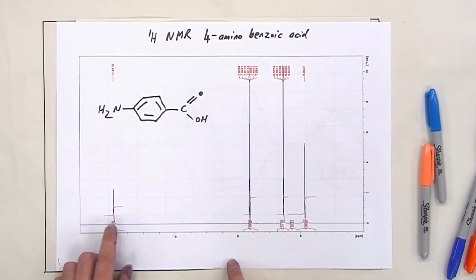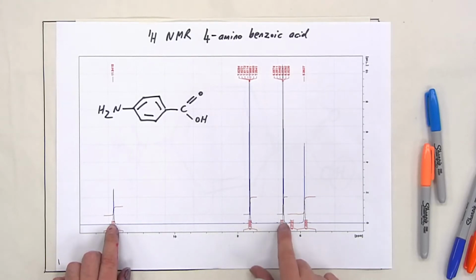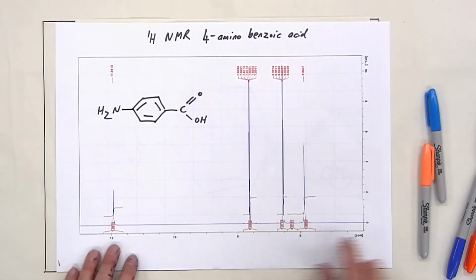And in this case we really would expect to see the aromatics looking quite different because they are adjacent to such different groups. So you would expect to see clearly defined peaks in the spectrum. We're going to get up the spectrum just to make sure that our prediction is what we expect, and yes, it is. So again, we've seen 4 signals. 1, 2, 3, 4 signals, which is great.